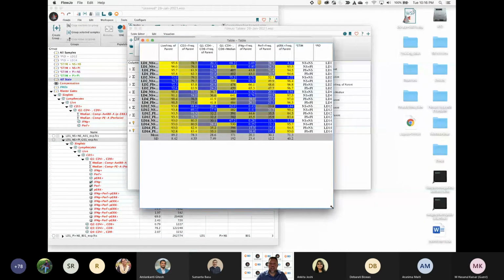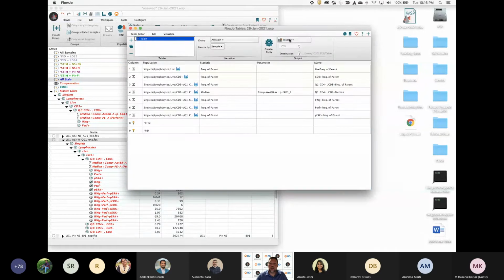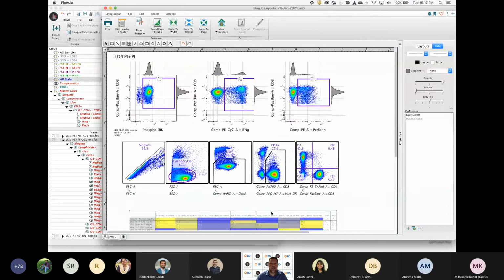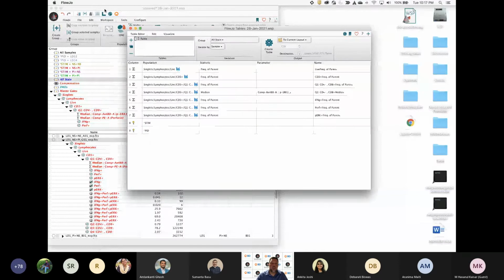And if I want to put that in that table with the formatting, the color formatting, I can go ahead and change that display to put it to my current layout and then create the table, and it shows this table now within my layout. And I could add that as a visual feature with all the numbers and make an image out of it, right? Just share with somebody.